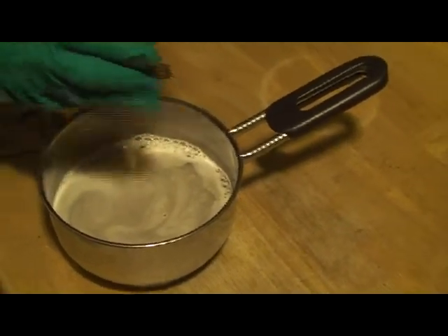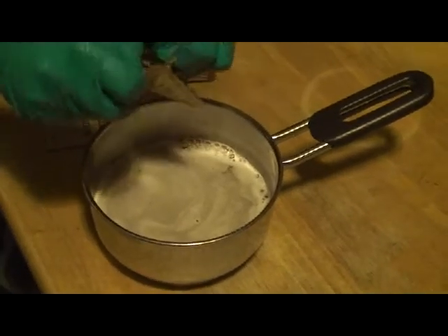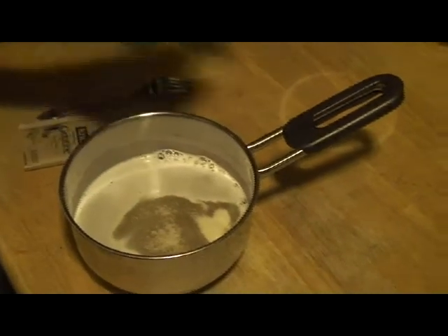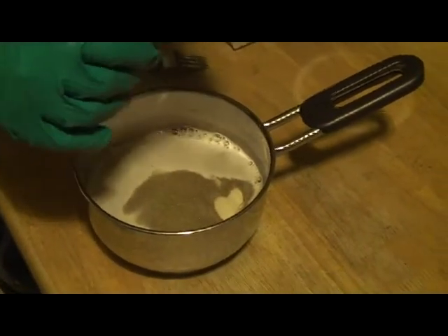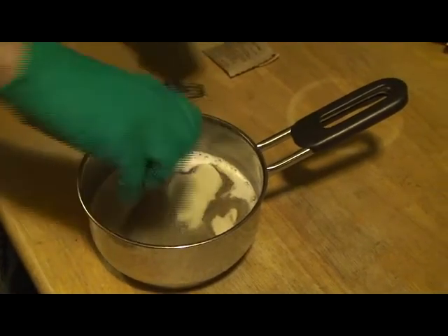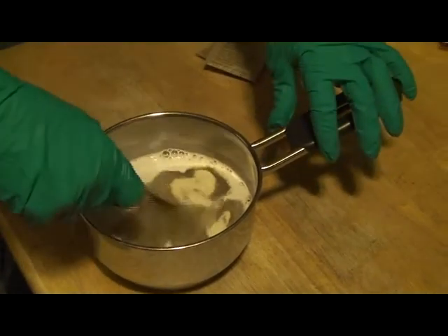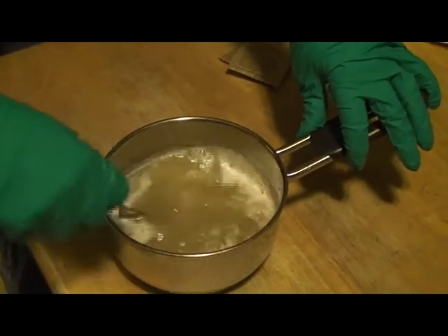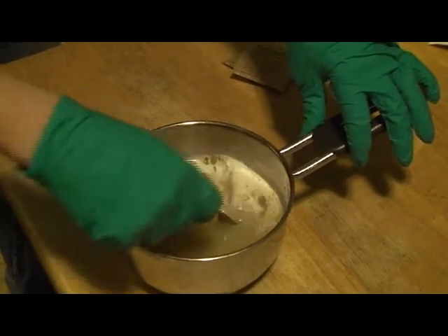Get them all stirred up. We're going to get this boiling for about 15 minutes, then we're going to cool it down and we're going to start making slants. Check back in 15 minutes, see how she does.